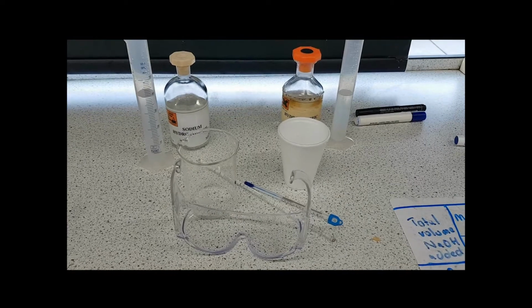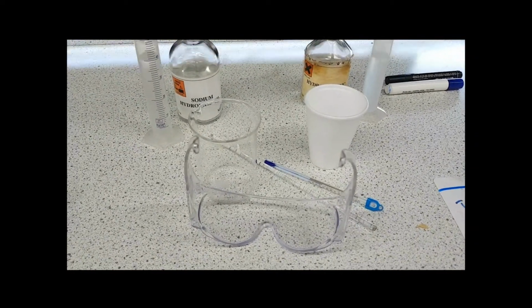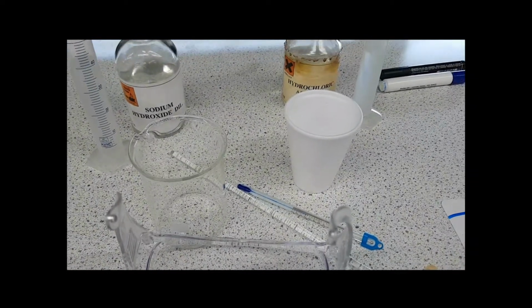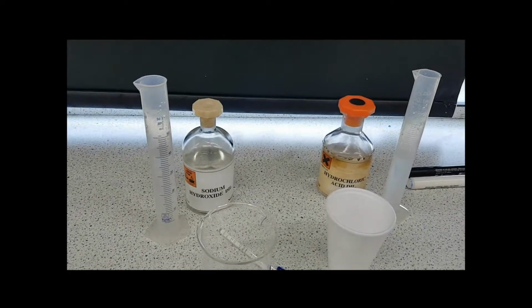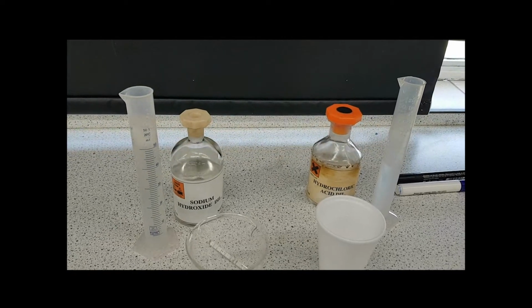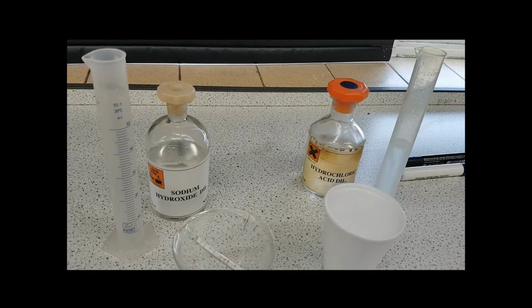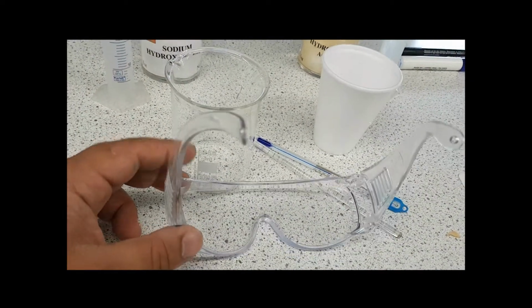This is for the chemistry required practical, and this is the equipment you will need. Goggles, stirring rod, thermometer, polystyrene cup, a beaker, two measuring cylinders, sodium hydroxide solution, and hydrochloric acid solution. You'll probably have two molar. I've got one molar at the moment. First things first, we need the goggles on.